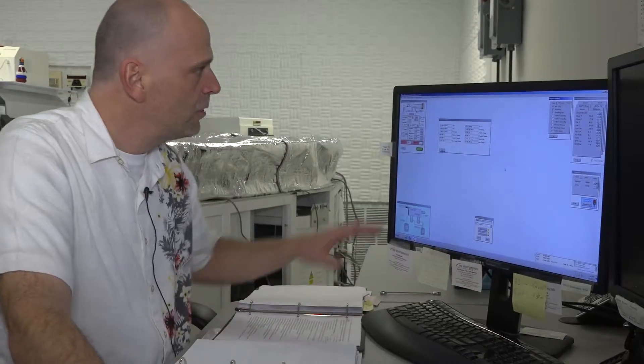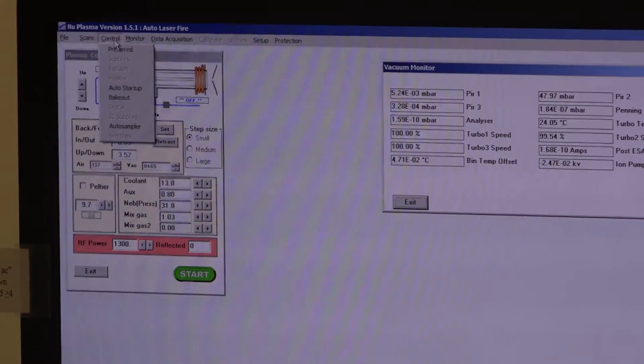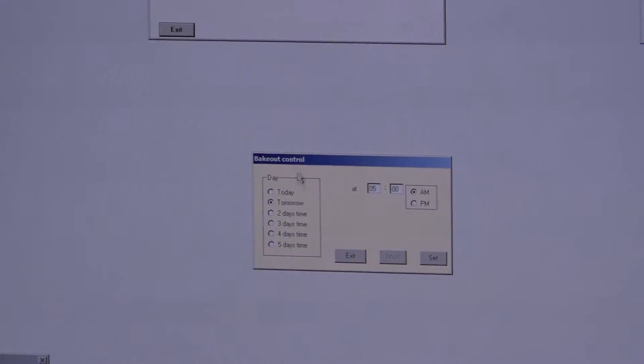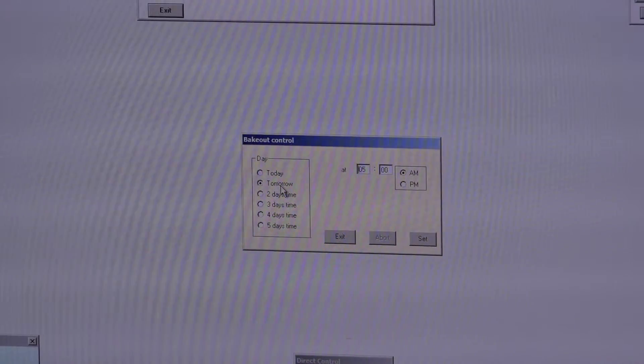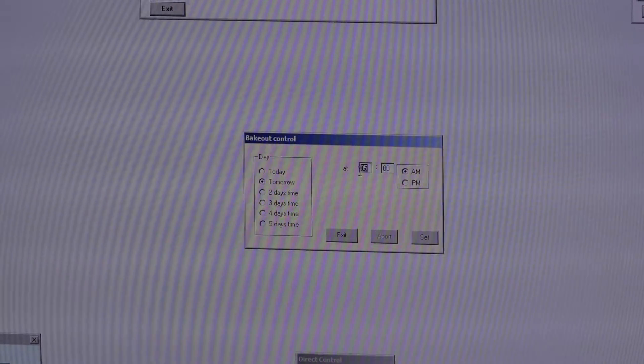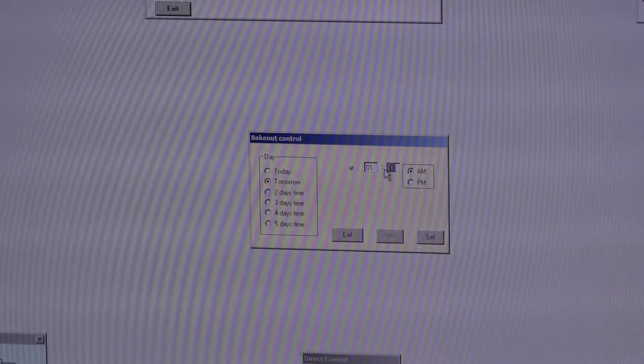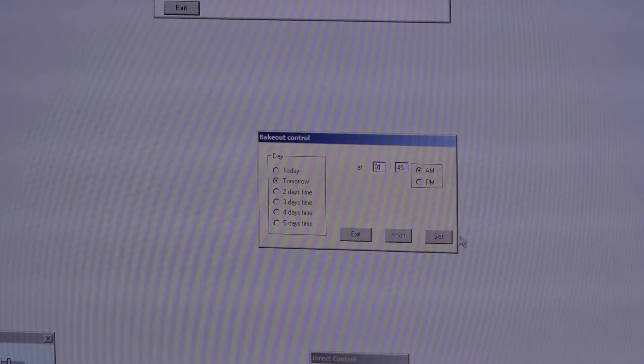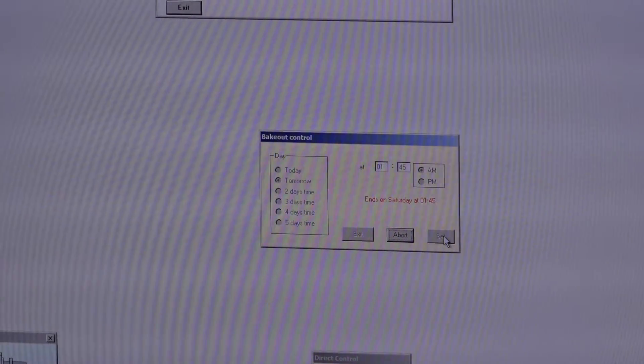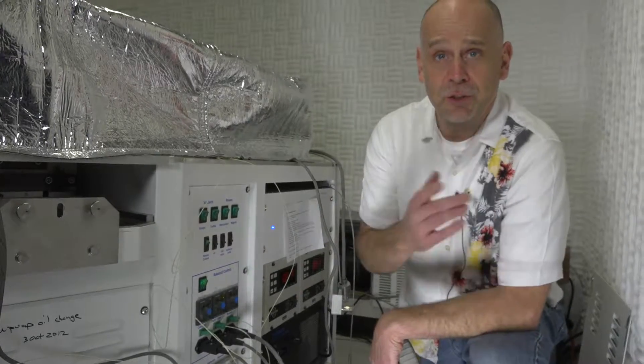Time to bake it up. So now we're ready to start the bake-out process. On the top ribbon, under control, it gives you a drop-down menu. Click bake-out. And the bake-out control window opens. And you're going to want to set the bake-out for 12 hours. So tomorrow, and you set the time 12 hours from now. And say set. And it tells you when the bake-out is going to end. And I'll see you tomorrow. Now that the bake-out procedure has been started via the software, you're going to want to go to the back panel of the instrument.